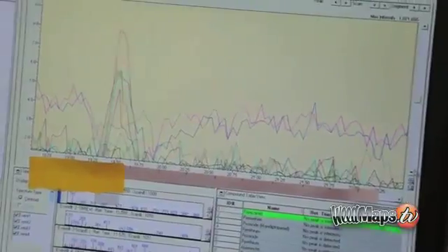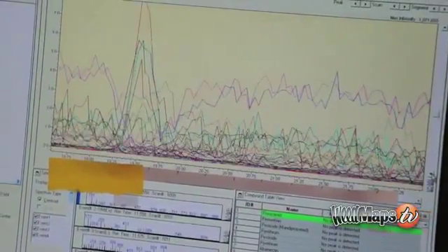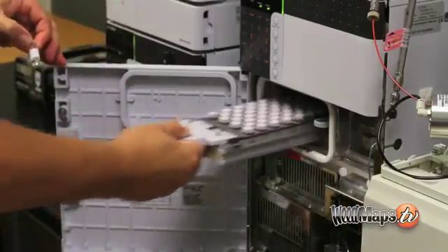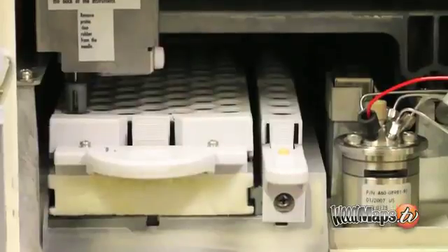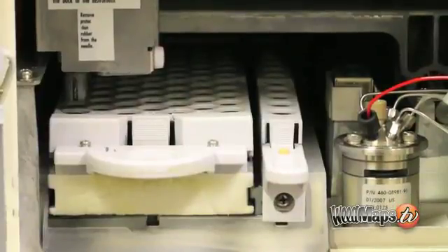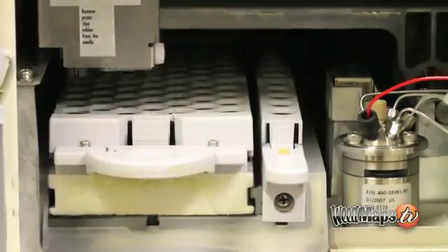We look not just for the obvious things, but any abnormalities, normalizing the data, making sure it's appropriate before we send it out. This method allows us to separate, identify, and quantitate over 30 pesticides, the five most important mycotoxins, and 15 cannabinoids.